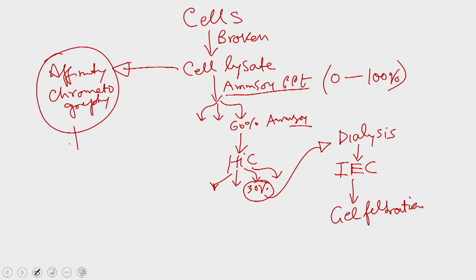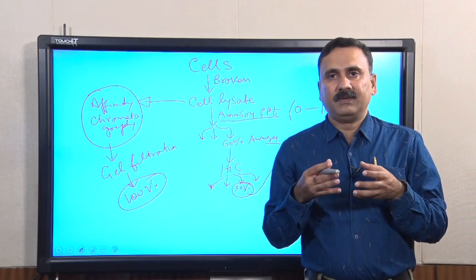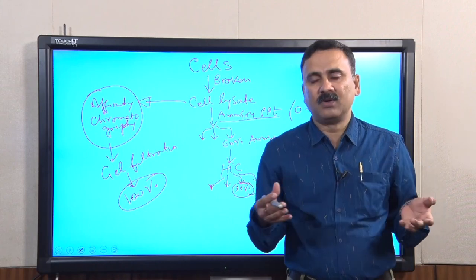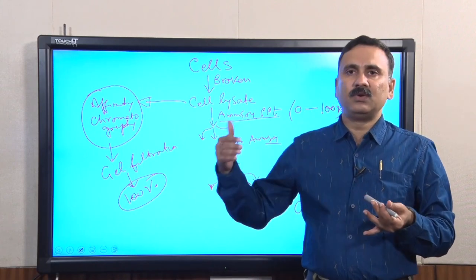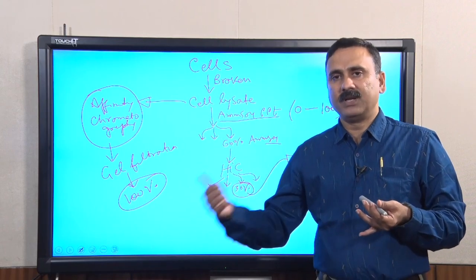Once you are done with this, you can simply run the gel filtration chromatography, and that will give you almost 100% pure protein, because the gel filtration chromatography may remove some of the aggregated material from your protein, and that is going to give you close to 100% purified protein.